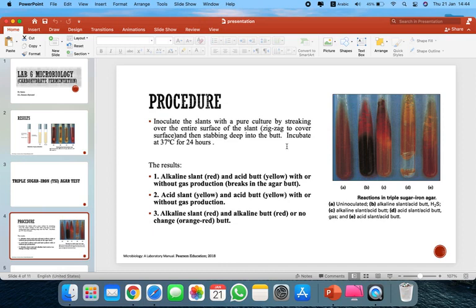Actually, the triple sugar iron agar test is designed to differentiate among the different groups of genera of Enterobacteriaceae. These grow inside the intestine. I have multiple types of genera of Enterobacteriaceae, or Enterobacteria, which are all gram-negative bacilli capable of fermenting glucose.